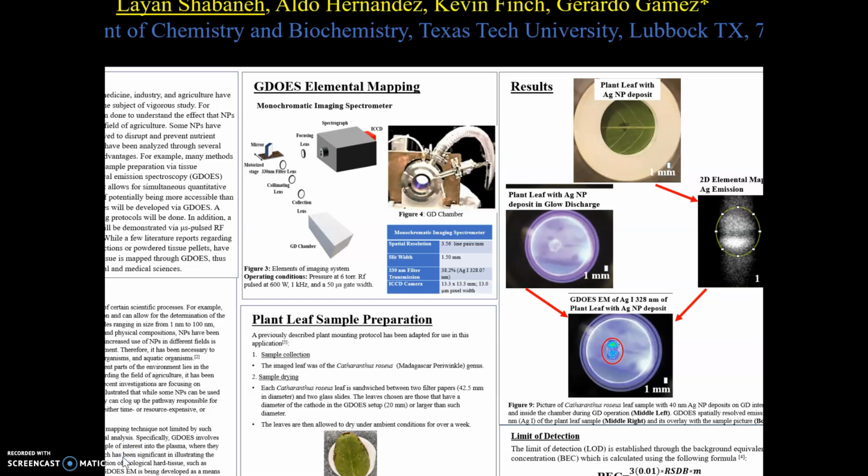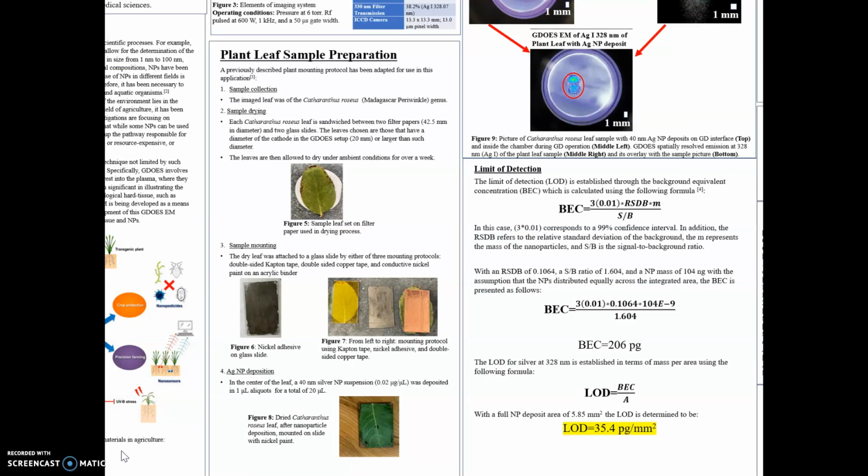The light continues traveling until it hits the mirror, which reflects it at a 90-degree angle into the focusing lens, which focuses it into the spectrograph. The point where the light meets is the focal point, and that's where an image is created. The 2D detector, which is the camera in our case, gives spectral information along the full Y dimension and a portion of the X dimension. As our mirror moves, the rest of the X dimension is filled in to give a full image of the nanoparticle spot.